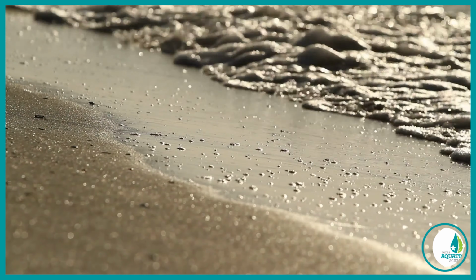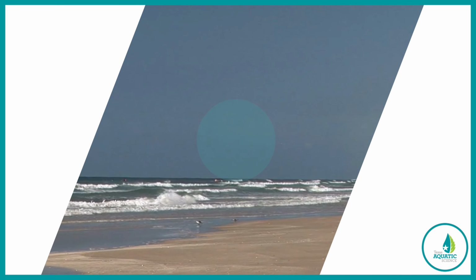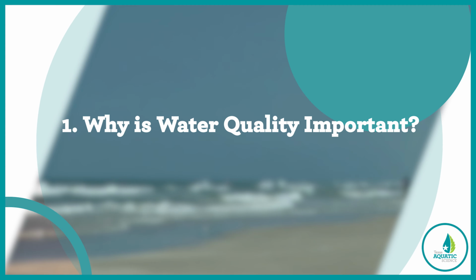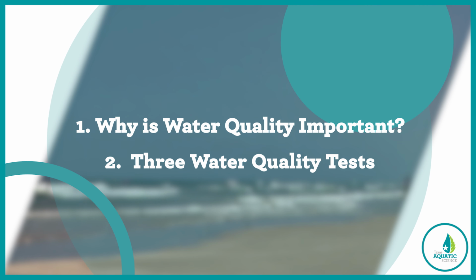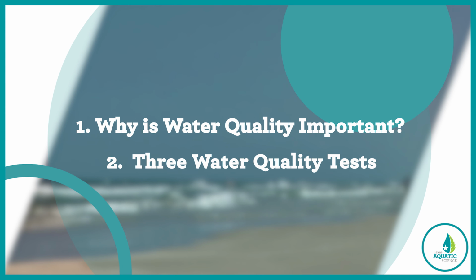Water quality is important, but have you ever wondered why? In this video, we'll explore the issue of water quality together, and you'll get the chance to see the procedure for performing 3 water quality tests that you can do with your teacher's help.